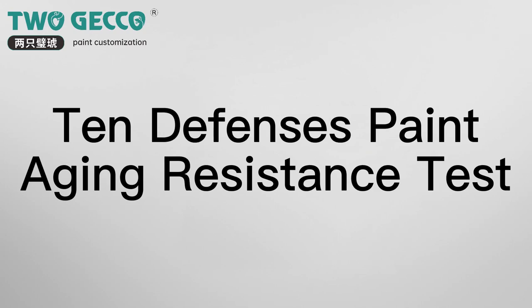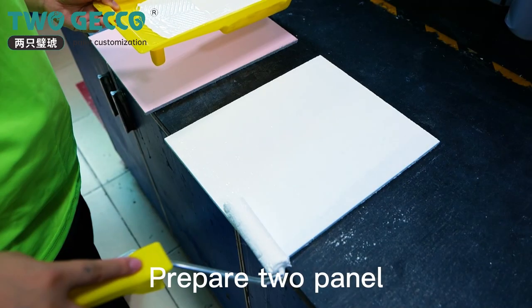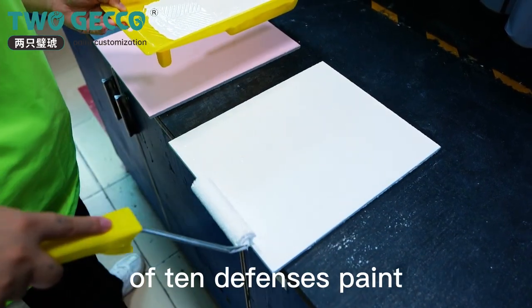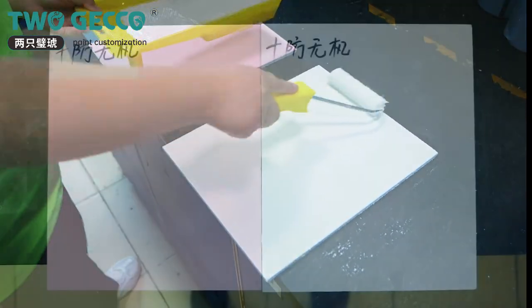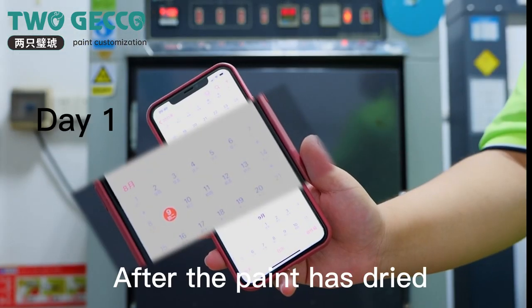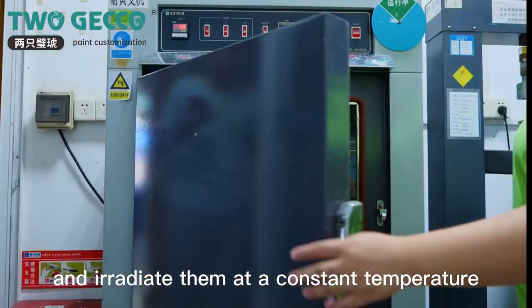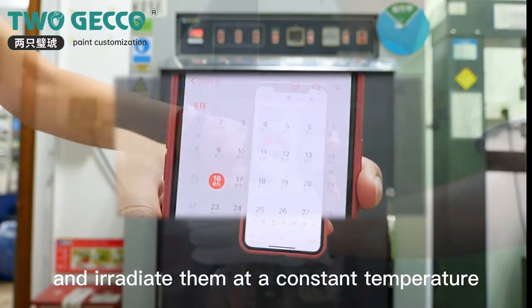Prepare panels and paint them with different colors of anti-aging resistant paint. After the paint has dried, put the two plates together in the yellowing tester and irradiate them at constant temperature.